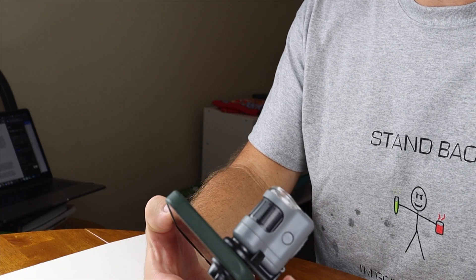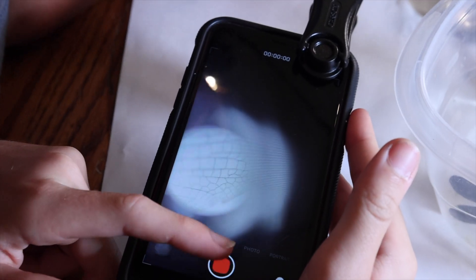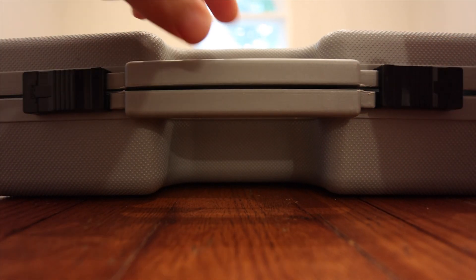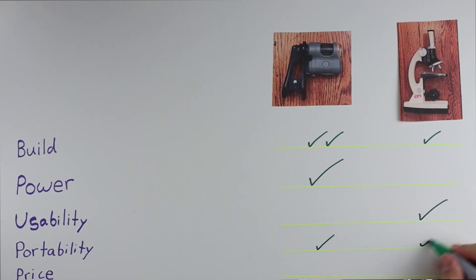All you have to do is attach the Carson to your phone and you're good to go — you can walk around and magnify things anywhere you find them. While the Amscope is no more complicated than any other traditional microscope, it can't compete with just clipping the Carson onto your phone and instantly being ready to view things, plus the ability to take pictures and make videos is an added bonus. The next category is portability, and the winner is the Carson Micro Mini by nature of its small size — you can literally put it in your pocket. However, the Amscope is not unportable; it comes with a nice form-fitting case, it's not heavy, and you can easily move it room to room or share it in a cooperative environment. I'm giving both a check mark, though the Carson beats it out just slightly.